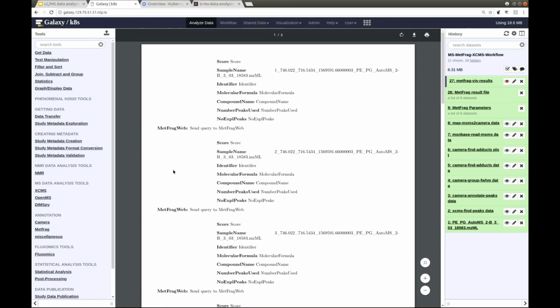There should be the structure, and what's biting me right now is that I have indeed been running a development version of Galaxy, and I didn't check the PDF yesterday evening. So that would be a bug that we need to fix, so that you can see the structure of the lipid here on the left in this PDF.